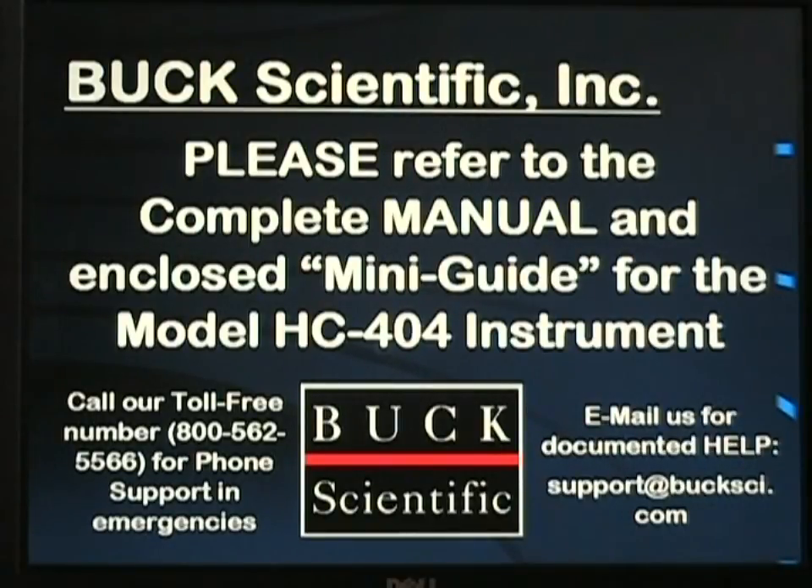This concludes the basic setup and operation for the Buck Scientific Model HC-404.